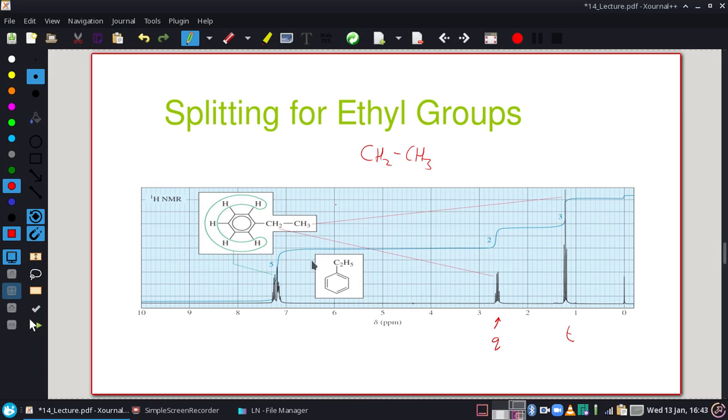Now, something else happens. You see how this kind of looks like a mess of things? Well, what's happening is we have 3 peaks that are definitely there because those are equivalent protons, but they split each other. And it actually kind of happens that anytime you have an aromatic ring or benzene ring, you get actual kind of random splitting unless you happen to have all equivalent protons. And you hardly ever have all equivalent protons off of a ring unless it's the ring all by itself.